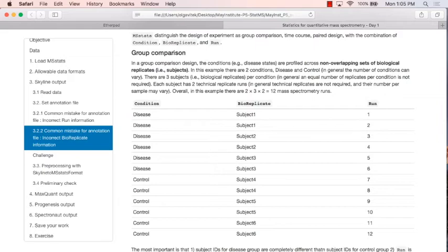And the last one is time course design. Say I'm the person, and I have a disease, and then I got some treatment, and they take my blood one month later, three months later, and then ten months later. That means I'm the same person, but they have different samples, right? We call this time course. In these cases, it should look like this: they have to recognize the same replicate, however with different conditions. Depending on how you annotate this versus this, we actually use different modeling for our hypothesis testing.